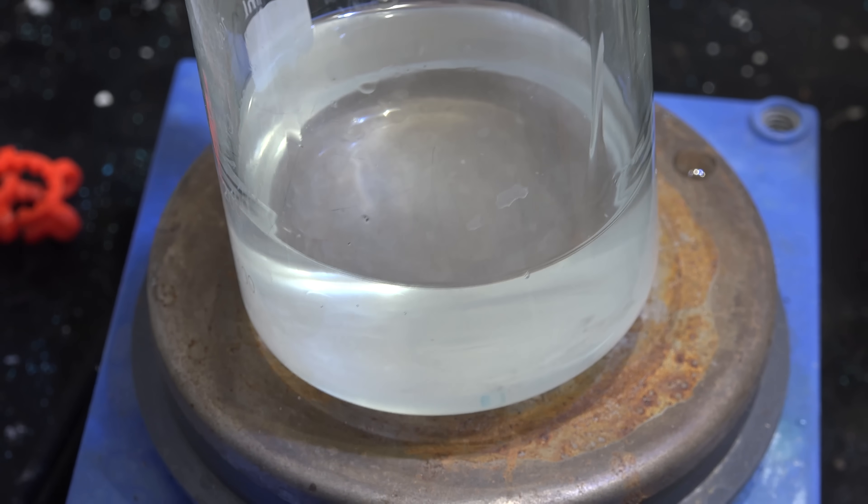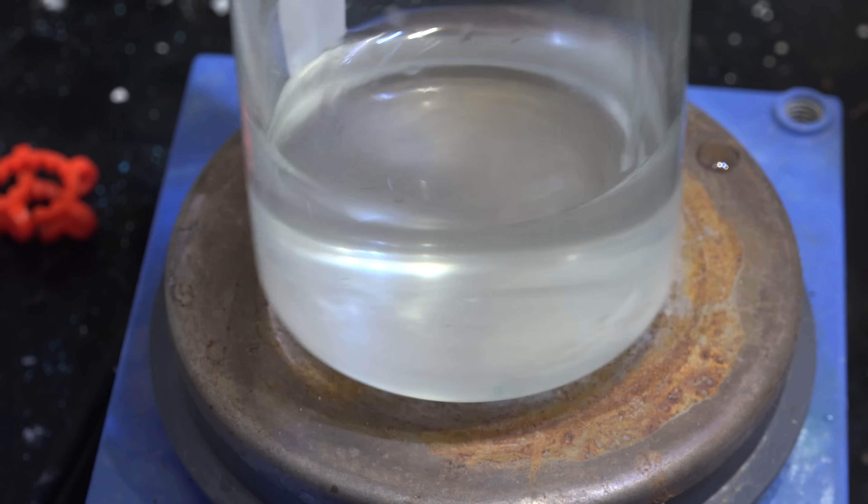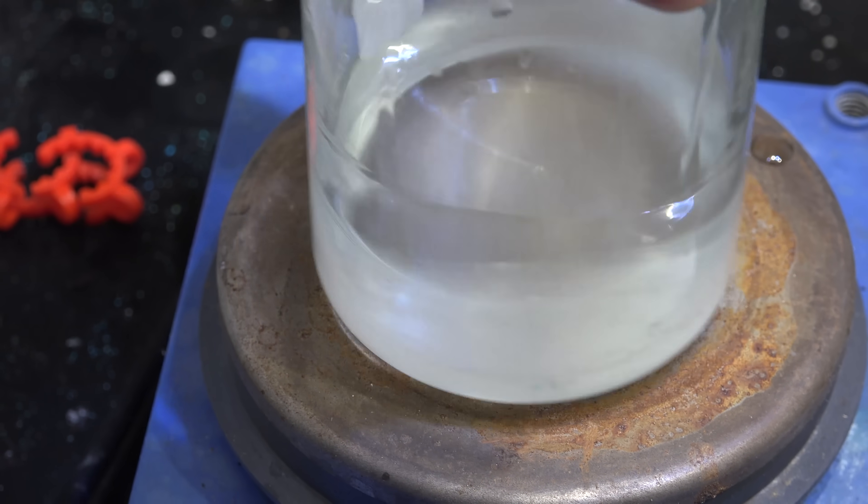And there we have it, a solution of sodium silicate. Now as said before, it will be a viscous syrupy mass. I recommend keeping it in liquid form and pouring off the quantity you need for your experiments.